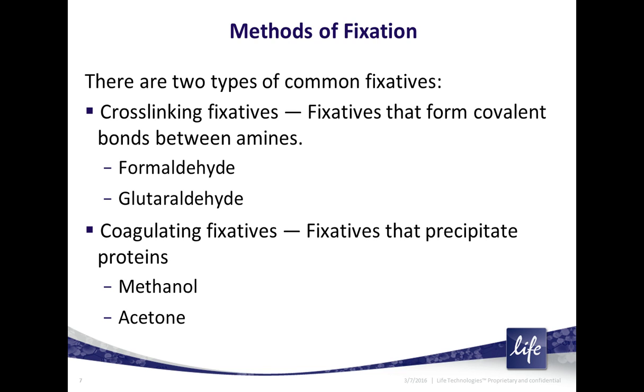The problem, however, with aldehydes is that they can increase autofluorescence. Autofluorescence is the native fluorescence of your tissues or cells. It's particularly a problem in paraffin tissue. Paraffin processing and fixation can cause a greater degree of background autofluorescence. And fixation with glutaraldehyde actually increases that beyond what you would see with formaldehyde. So for most fluorescent microscopy usage, you want to avoid glutaraldehyde for the autofluorescence reason.